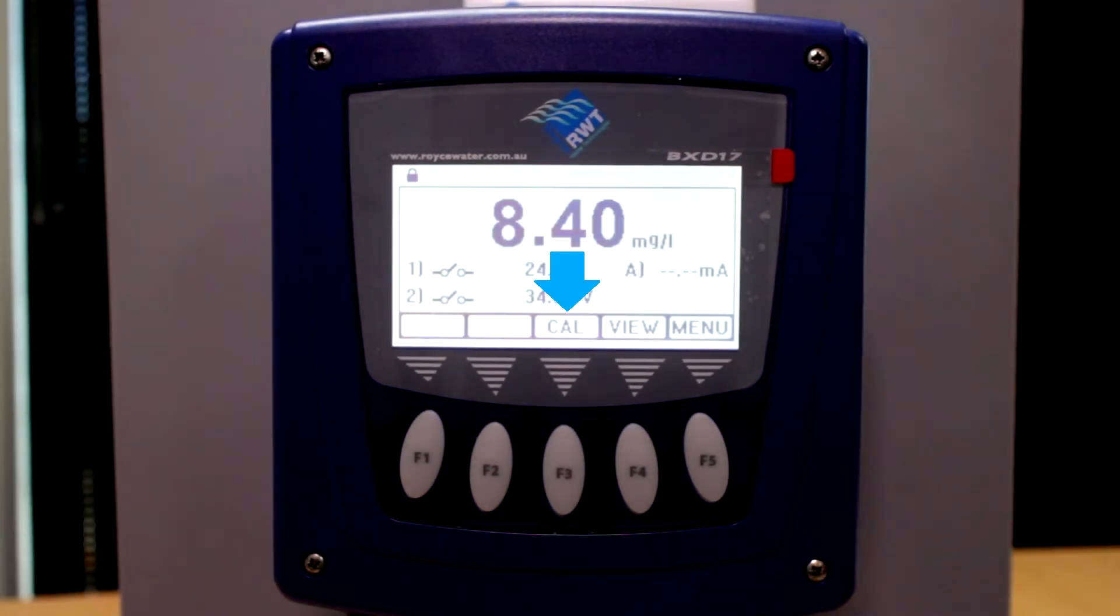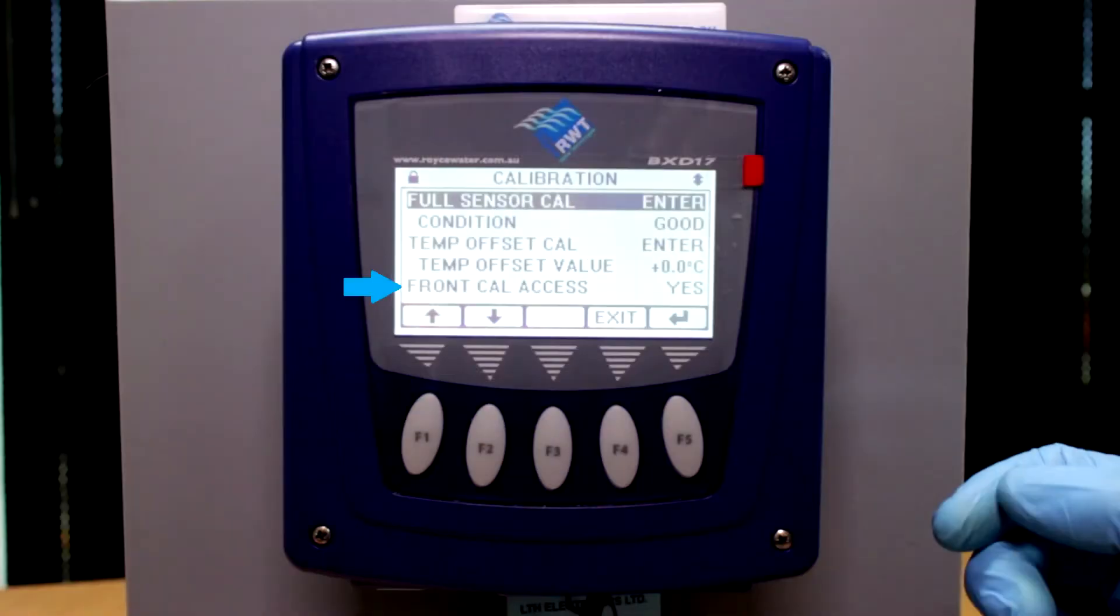A shortcut to the calibration option can be found on your front screen using the F3 key. If this option is not showing, it can be switched on using the calibration menu.